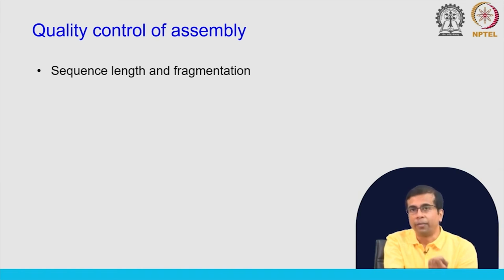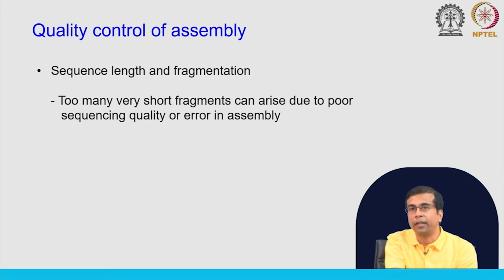Similarly here, we have an idea about the transcripts. We are working with an organism where we know, let us say, around 10,000 genes are expressed. And if we see that there is a huge number, much more than 10,000 fragments, obtained after assembly, this might mean that the assembly process was not very good, or there was not enough data for the assembler to actually do the complete assembly. So, this is what we can assess.